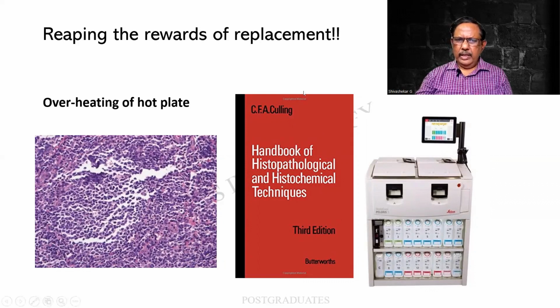It is worth it. And in all of this, I will not be able to locate where exactly the problem is. Is it within the tissue trough, or is it within the wax, or is it because of the various reagents, or is it because of the time set in the monitor? Difficult to locate.